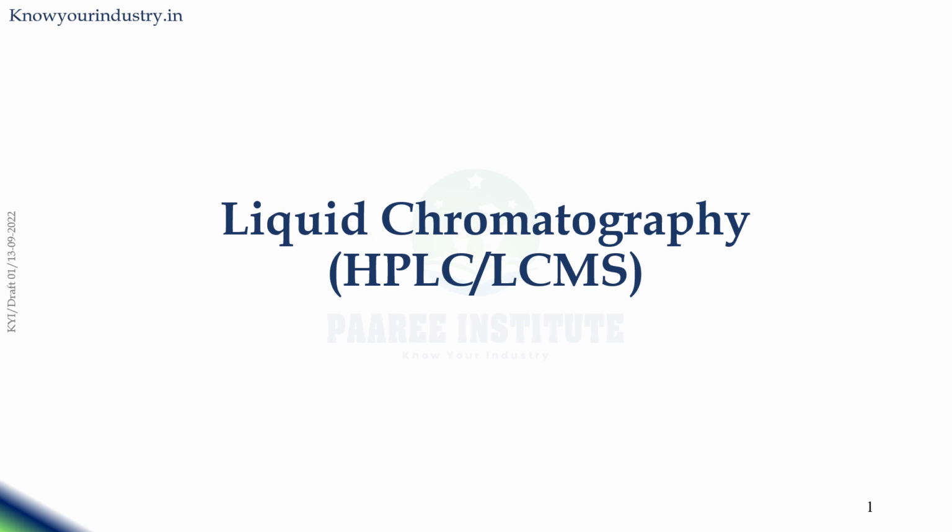We will see how the methods are developed in liquid chromatography, the principles of liquid chromatography, and also the applications of liquid chromatography in the upcoming slides.